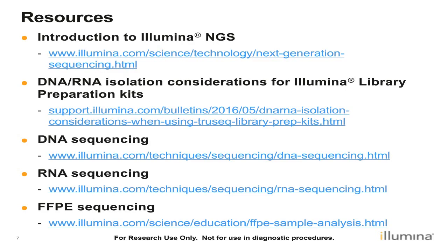We have some resources here: an introduction to Illumina Next Generation Sequencing, a bulletin which gives information on DNA and RNA isolation, and overviews of DNA, RNA, and FFPE sequencing.